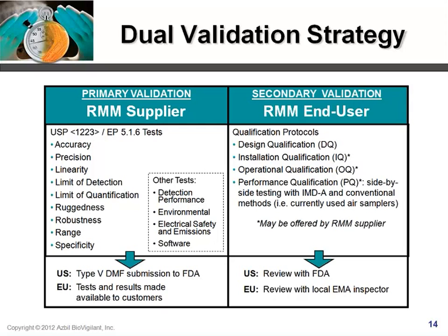So the general applicability of this approach for any given RMM obviously depends upon the specific RMM you're talking about, the application, and the regulatory arrangement that your company may have. But for an aerosol environmental monitoring method like ours, it's generally been regarded as either an in-process control and not necessarily requiring a comparability protocol, which is often a requirement in the US, or a type variation, which is often a requirement in the European Union for implementation.